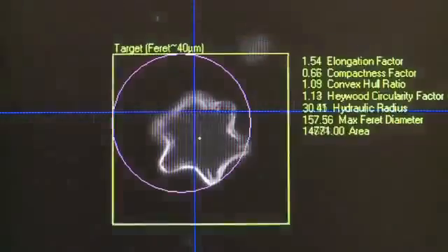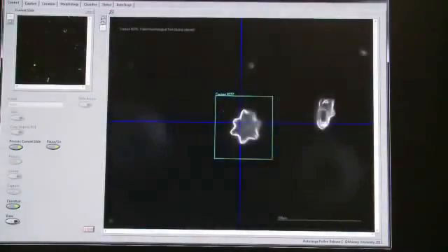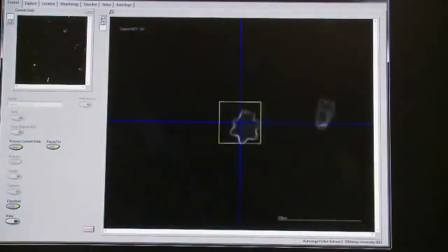The microscope lens goes over the slide and takes a low resolution picture, then shifts to a second lens. Under high magnification the microscope takes images of the pollen grain right from the top down to the bottom — nine images stacked together, a bit like a pack of cards. Those nine images are then transformed into a three-dimensional image of the pollen grain.